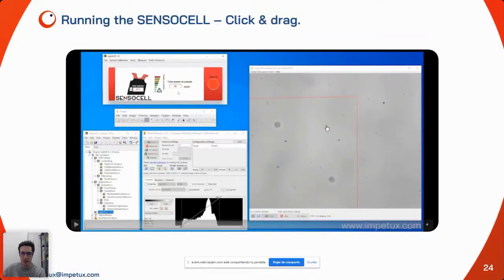So we have an optical trap here. This is the trapping area, okay, this red square. And we have two microspheres. We will click on the optical trap, move it over the microsphere, and it's trapped. And we will now generate a second trap by clicking on the screen. And then we move it around by dragging the mouse icon. And that's it. Okay, it's very simple. So you generate the traps like this, just by clicking and moving them. But this is done manually.